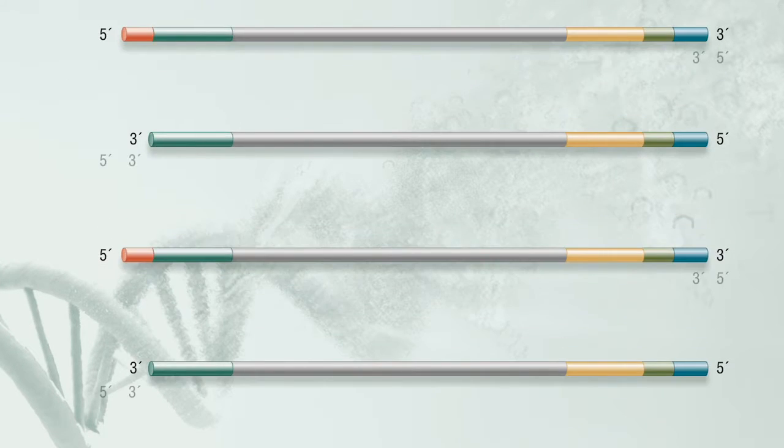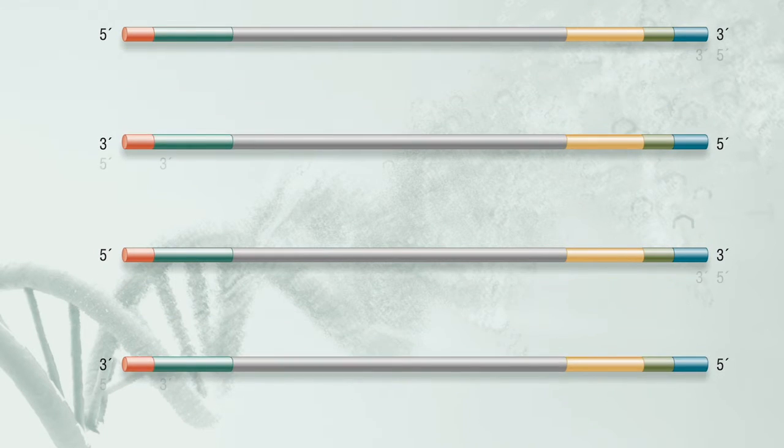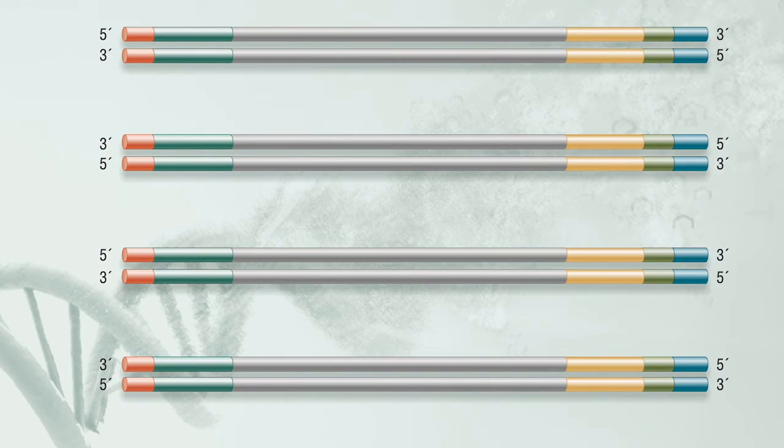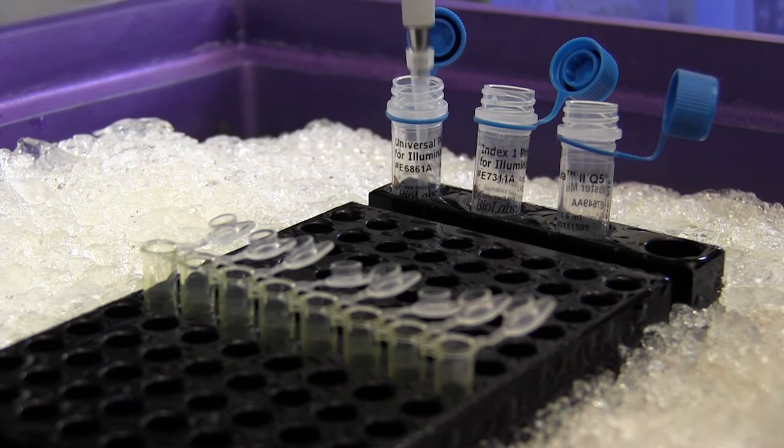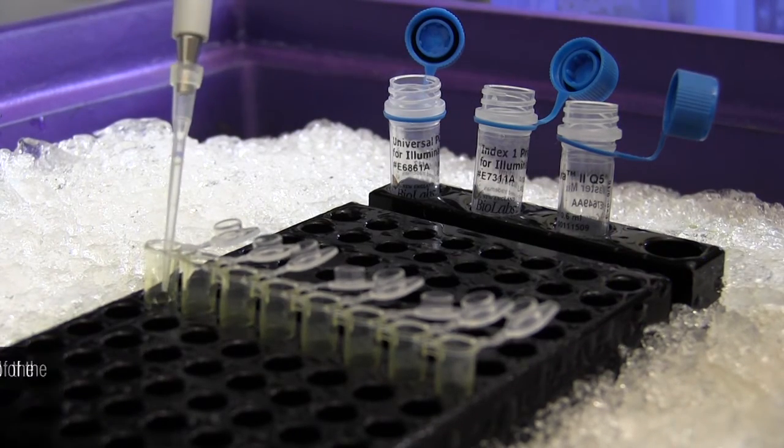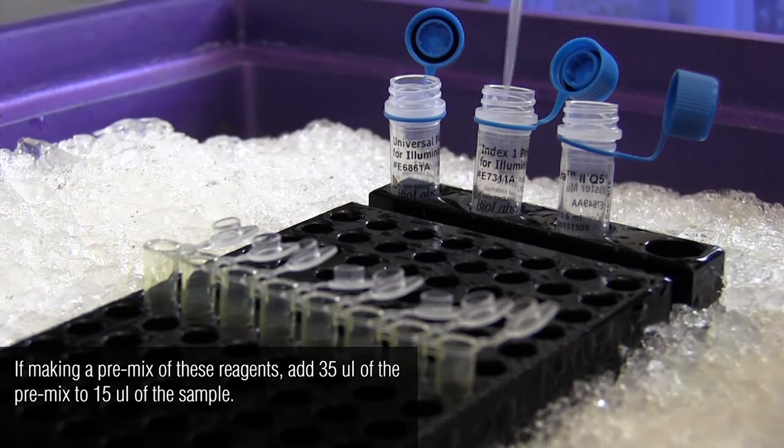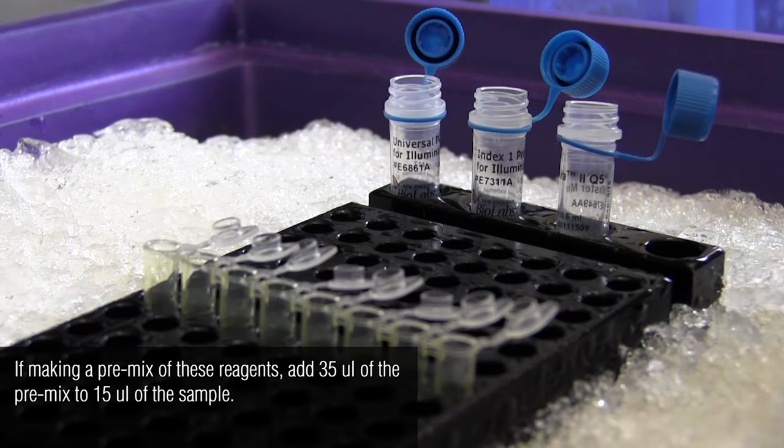For multiplexed libraries, indices or barcodes can be introduced at this step if the NEBNext adapter and primers are used. To each sample, add the universal PCR primer, an index primer, and the ULTRA2 Q5 master mix which are in the blue capped vials. Mix thoroughly as shown previously.